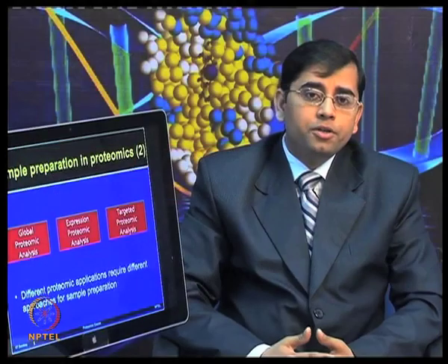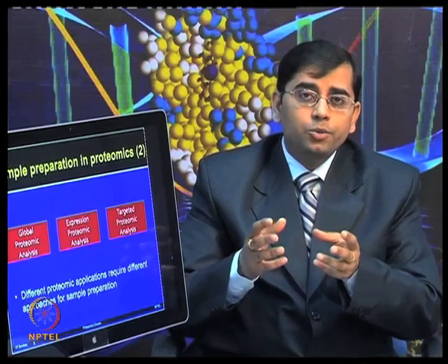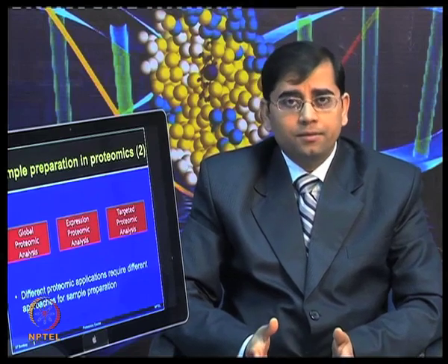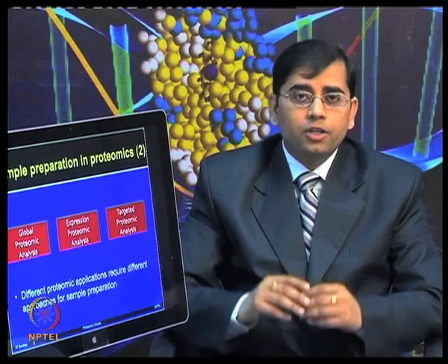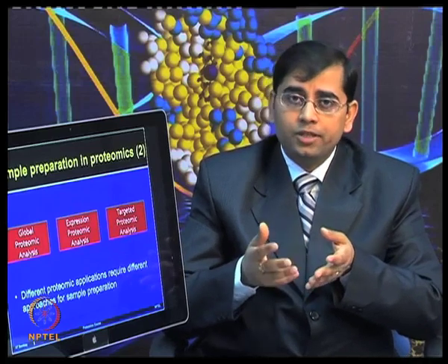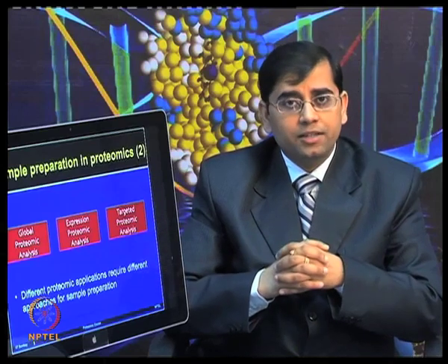When I am talking about global proteome analysis, it means your aim is to characterize all the proteins present in the given sample. Expression proteome analysis means you are mainly interested in looking for those changes which are due to any chemical or treatment, those induced either going up or down, where the protein amount is changing.